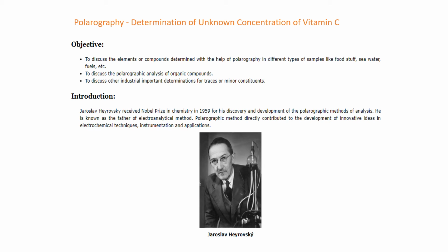I would like to introduce another method for analysis of vitamin C, which is the polarography method. Polarography is a very old method, based on electroanalytical methods. It was introduced by this man, Jaroslav Heyrovsky, who received a Nobel Prize in 1959 for his discovery and the development of the polarography method of analysis.